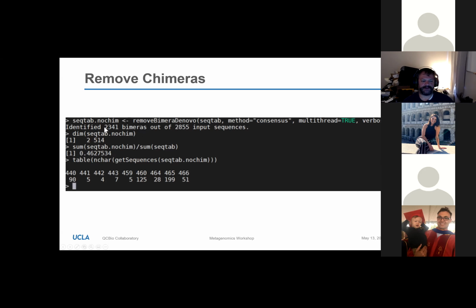So what we have is a ton of chimeric reads, or a ton of chimeric diversity, which isn't actually all that surprising. That's pretty typical, as chimeras tend to show up as low abundance reads that are very diverse. So that ends up leaving us with only 514 reads that are unique and not chimeric. And we see here that unfortunately it looks like we had a ton of chimeras in our library. That sometimes happens. Sometimes you can optimize your library prep to get rid of that.